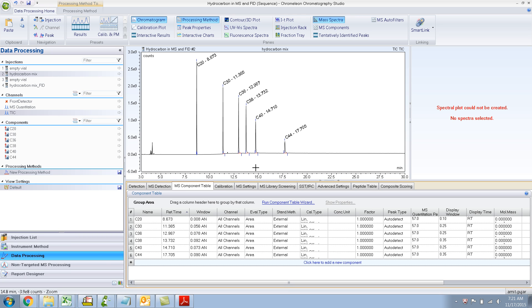Today I wanted to tell you something about components. You see these components over here? Components are nothing but what you have in your component table. You need to fill your component table with the compounds that you want to quantitate for, the ones you want your calibration curves for. These components will show up under components.